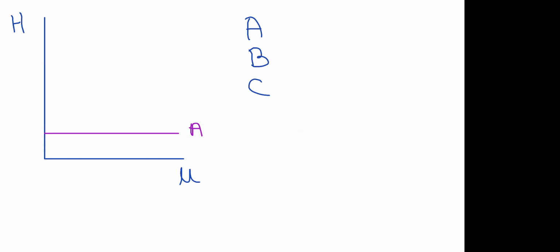Now, when we have longitudinal diffusion, then the longitudinal diffusion is actually dependent on the flow rate. The faster the mobile phase is passing through the column, the less time the molecules have to diffuse longitudinally.